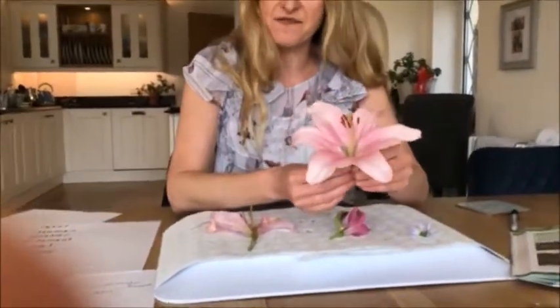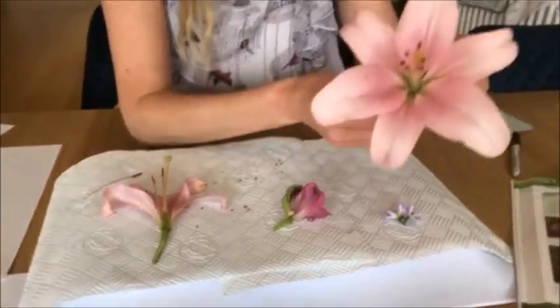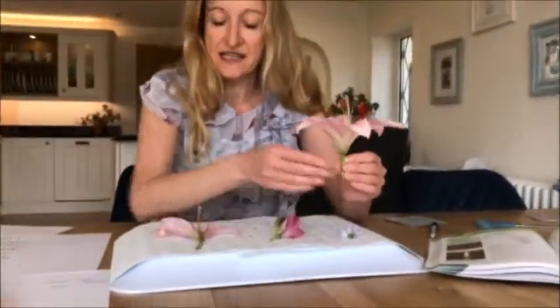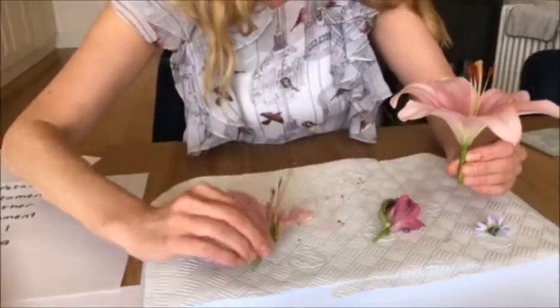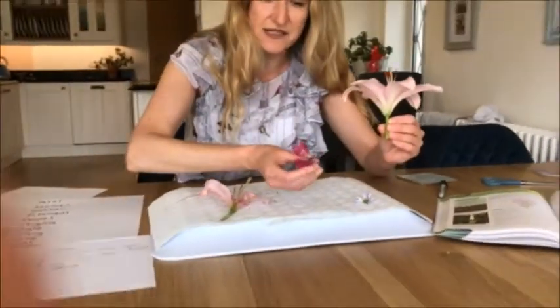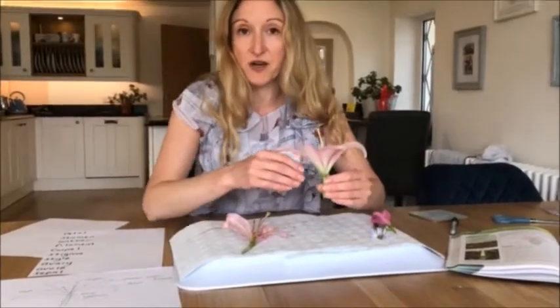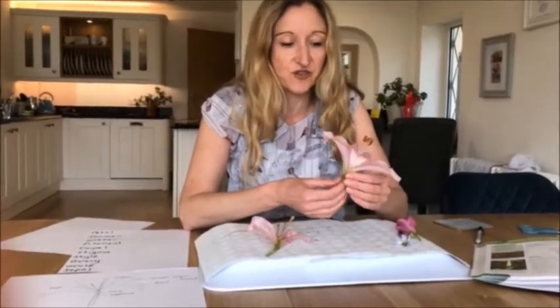And I happen to have some lilies for us to have a look and dissect. So this is what the lily looks like when it's intact, and this is what it looks like when it's been dissected. And I've just got some different types of flowers that we can have a look at. And although I wouldn't recommend you go out and pick loads of flowers from your garden, it may be that you have got some flowers like old daffodils, if there's any left, that you can have a look at and try and identify these different structures.